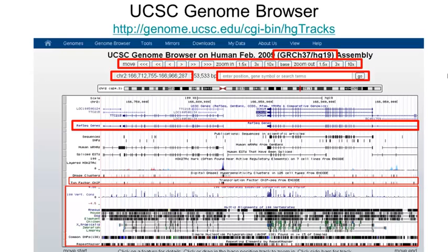The alignments were done by lastz and multiz, and the levels of evolutionary conservation were calculated by phastCons and phyloP. Such large multiple alignments are extremely computationally intensive and impossible for small labs to do. It took the staff at UCSC 15 years of CPU runtime, not human time, in 10 million individual jobs and 100 cluster runs. Finally, what is not shown on this slide are lots of other useful tracks on repetitive elements, genetic variations, known disease or phenotypes, and so on.